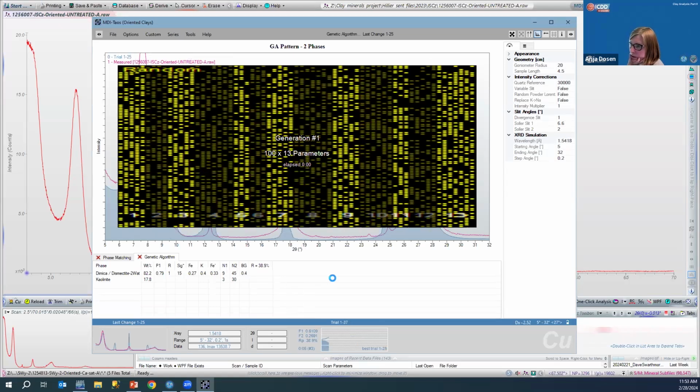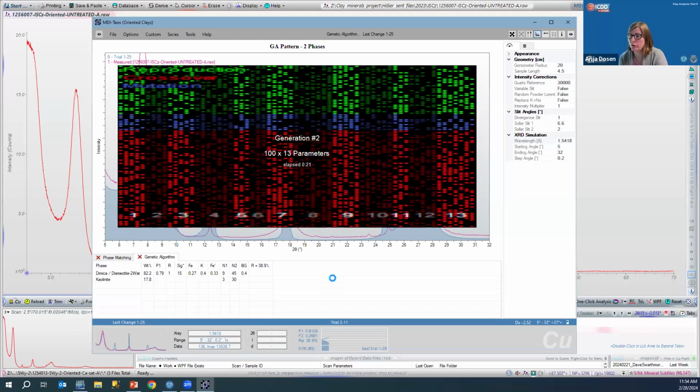This is done so that it resembles a biological or organic analysis. This is a sequence like chromosomes, so it will move on to the new phase of reproduction, crossover, and mutation, where crossover would be the mixing of phases, mutation would be a random change. It would randomly change a parameter or a bit, and so on.